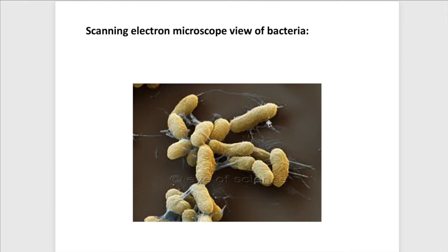So here's bacteria like we saw with the light microscope, and now I can see there's a shape here. There's a front, there's a back. I can see these little fibers these things are using to stick themselves together. Now, these things have been falsely colored. Somebody came and colored them because the electron beam doesn't have a color, but still, the example holds.